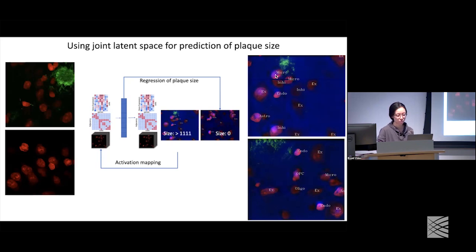So if we look here, this microglia is, for example, very predictive of this plaque nearby. But if we look at this inhibitory neuron, it's all very low intensity blue. It means that this inhibitory neuron is not yet affected by the plaque nearby, and it's perhaps not very different from the inhibitory neuron that's further away and not affected by plaque.